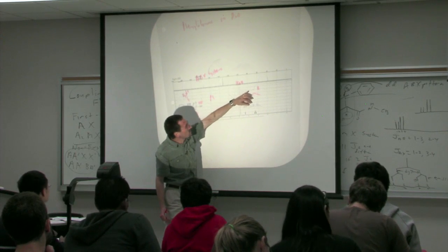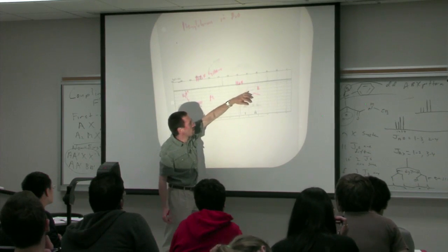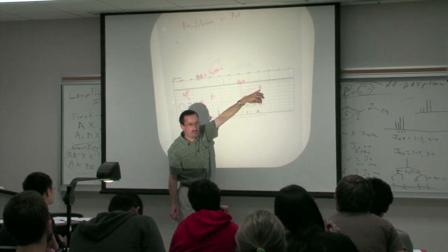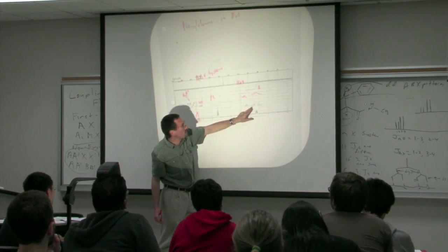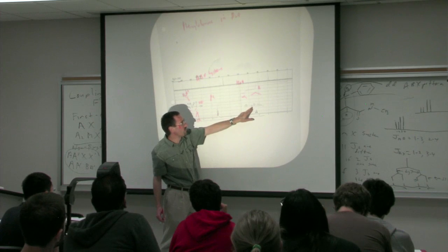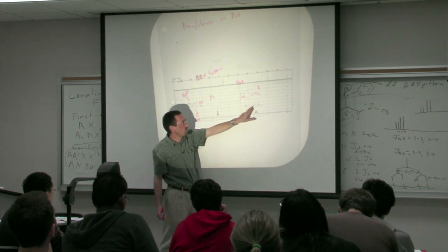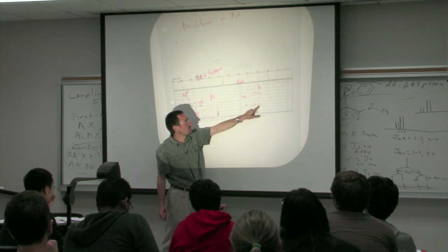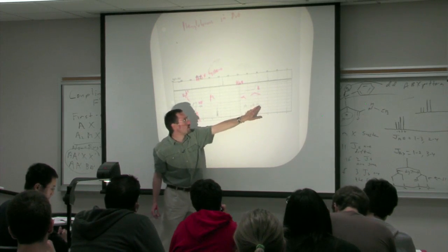And you'll notice the distance between these two lines does indeed match the distance between those two lines. In other words, the 1 to 3 or 2 to 4 distance does match the 1' to 3' or 2' to 4' distance. And you'll also notice that the two couplings with the alpha proton are a little bit different from each other. If I had to eyeball it here, the distance between 1 and 2 or 3 and 4 is about 6 hertz, and the distance between 1' and 2' or 3' and 4' is about 8 hertz.